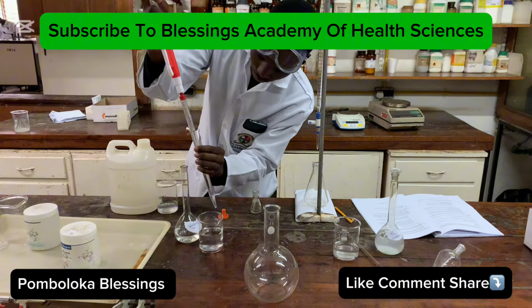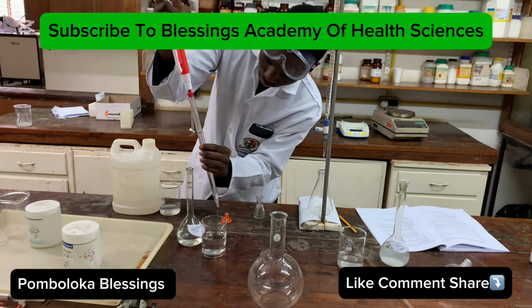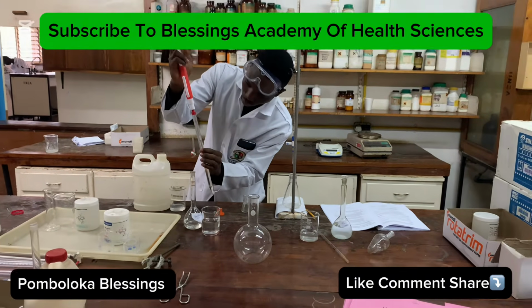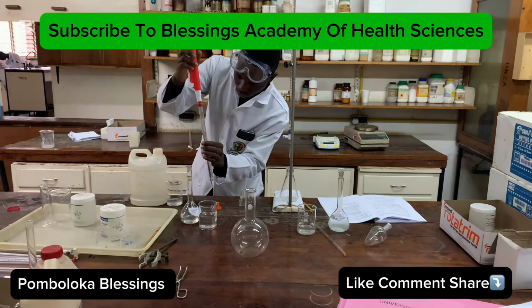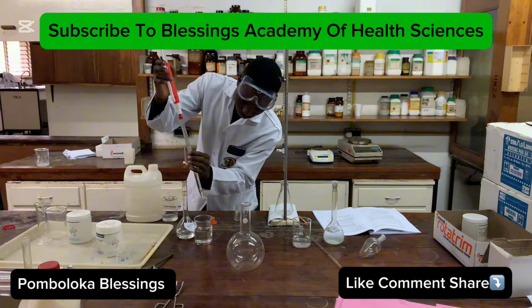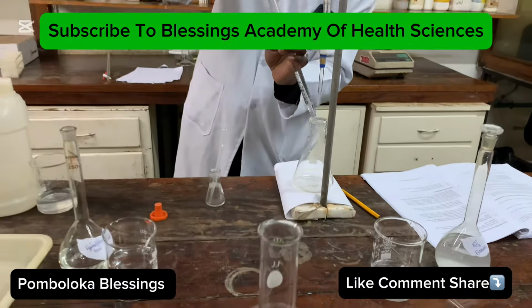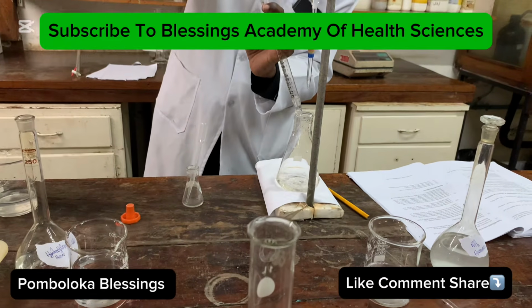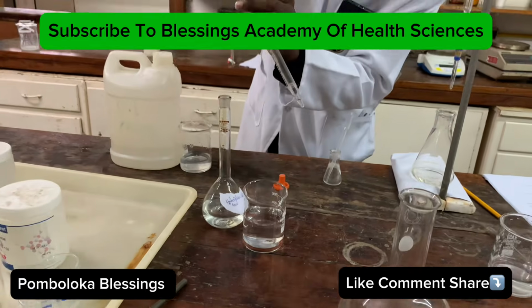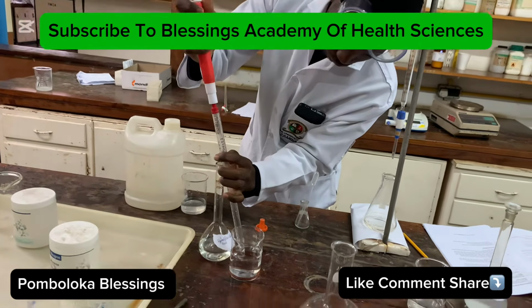We are already at 24 there. We need to get 25. So the pipette runs up to 24 milliliters. So remember what we need here is 25. So my 24 is in there. We need 25, so I'll just add on 1 milliliter there.